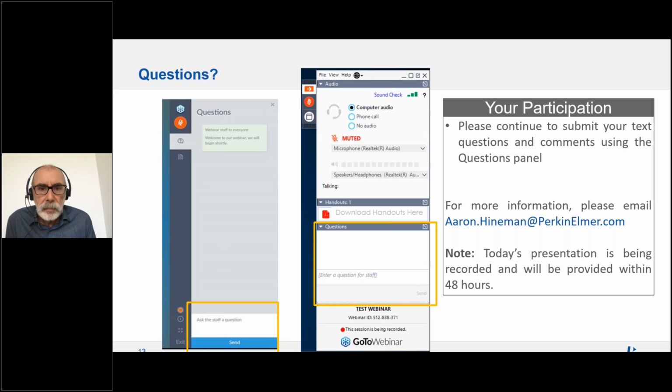Thank you. And then the final question, which reference material is used to calculate nebulization efficiency? Well, standard reference material for plastics, at least for us, has not been easy to find, thinking of number concentrations.